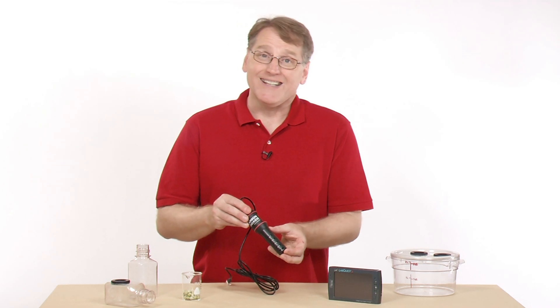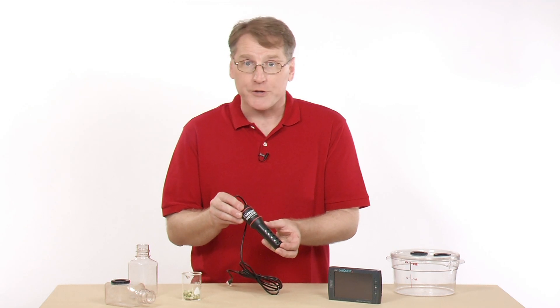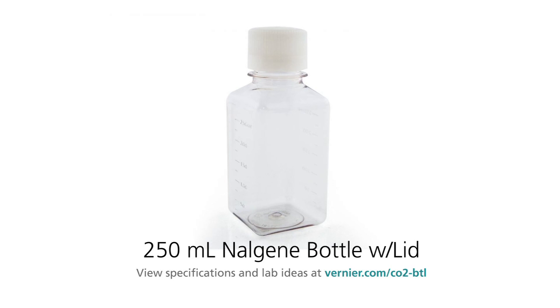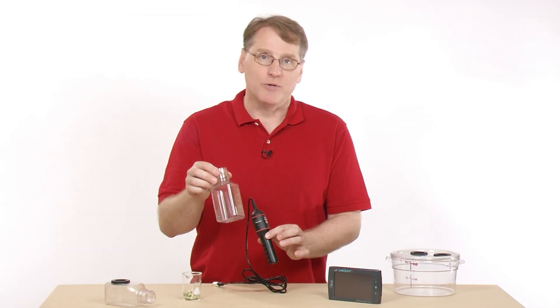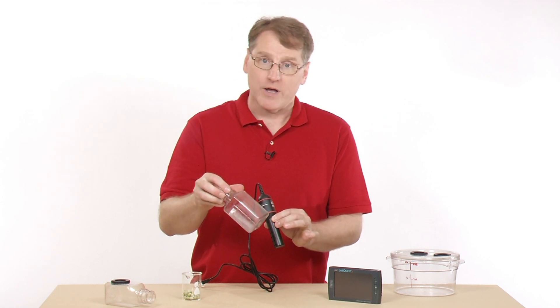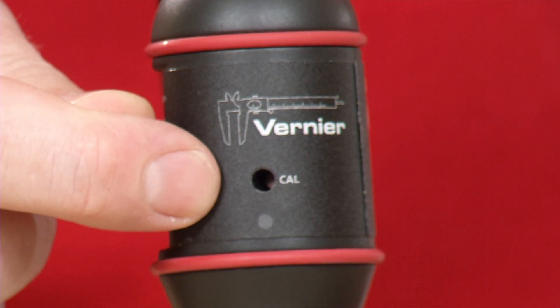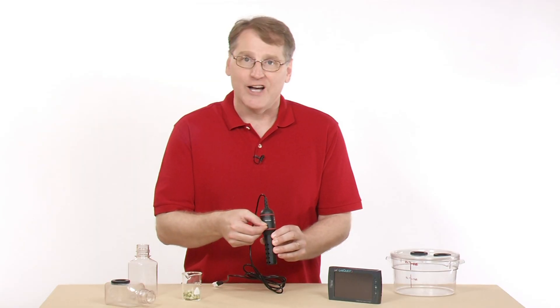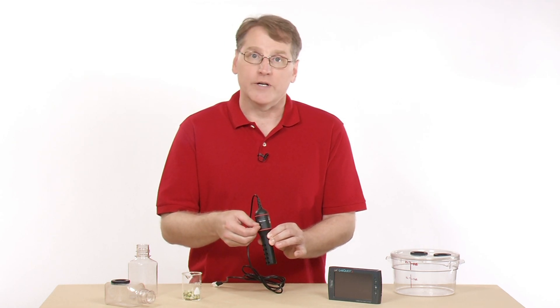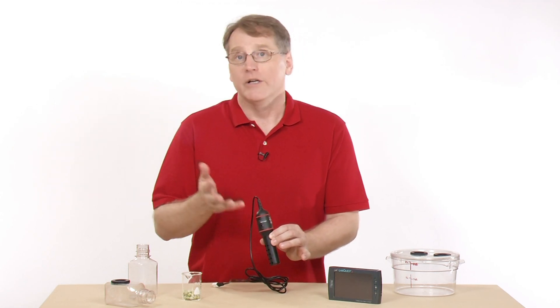The sensor generally doesn't need to be calibrated, but you can. To do the calibration, it's important that you put it into a known condition. Take the Nalgene bottle that comes with it, collect a sample of air, put the lid on, bring it back in, and do the calibration that way. There is a calibration port right here, and you can use a paper clip to press down on it until the unit stabilizes. It will end up with a reading of 380 parts per million, which we assume is the CO2 level outside in open air. Then you're good to go.